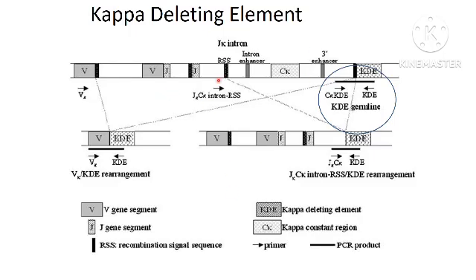You don't want the kappa signature to be there, and you don't want the cell to go for lambda rearrangement, because when I try to design a primer for IG kappa, that non-productive rearrangement will be picked up by my primers. So I won't know whether that is a functional or non-functional rearrangement unless I take a template from cDNA instead of genomic DNA. That is the only way to differentiate functional and non-functional rearrangements.